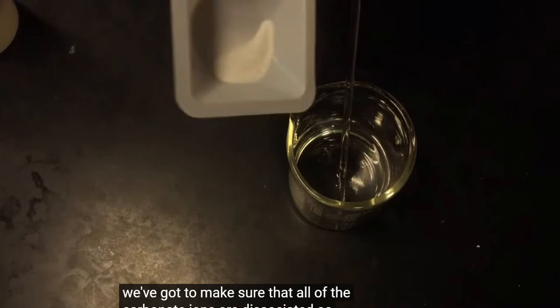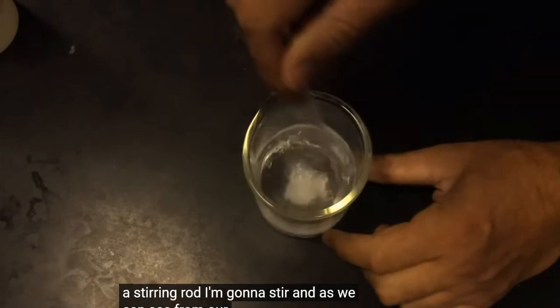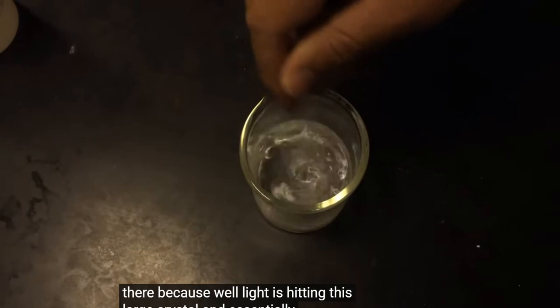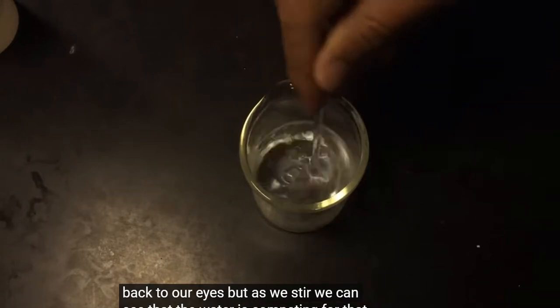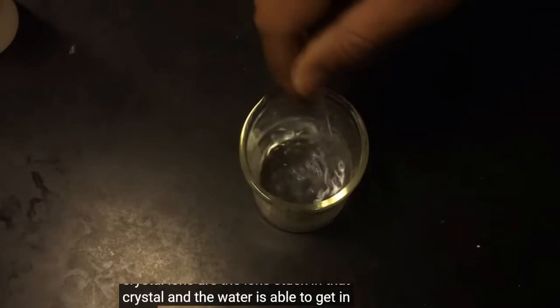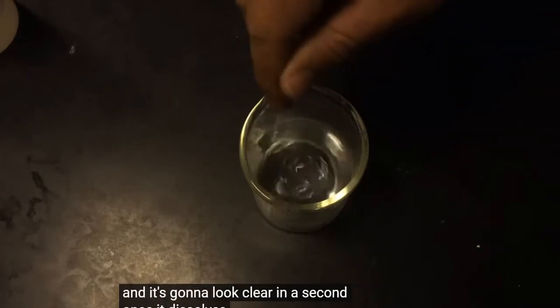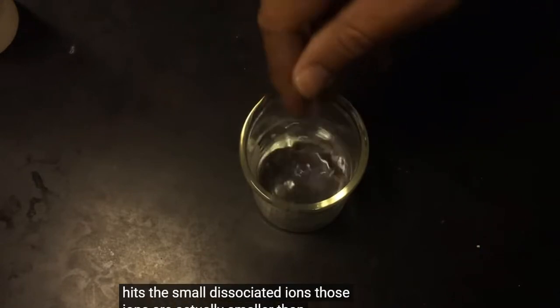So now I'm just going to add them here, and with a stirring rod, I'm going to stir, and as we can see from our solubility rules, right now we see that solid at the bottom here, because light is hitting this large crystal and essentially reflecting back to our eyes. But as we stir, we can see that the water is competing for the ions stuck in that crystal, and the water is able to get in there with its partial positive and partial negative charges and pull away the group 1 ions from the carbonate. It's going to look clear in a second once it dissolves, because those ions are actually smaller than the wavelength of light, and therefore light kind of travels right through.